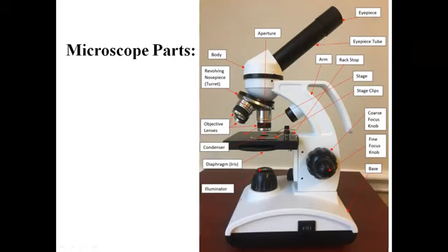Okay, so what is the head portion consisting of? It consists of the eyepiece, the place where you are focusing or viewing the sample. Then you have your eyepiece tube. Okay, this tube can vary in length. It can be short, it can be long, depending on the type of microscope that you are using. So next thing is about the body. Okay, this is your body.